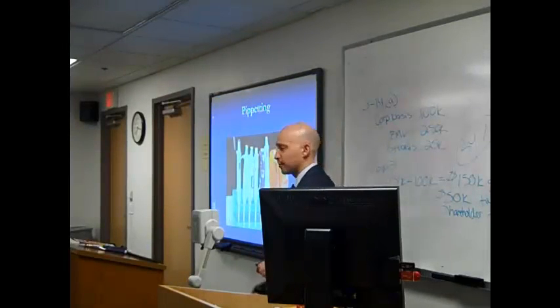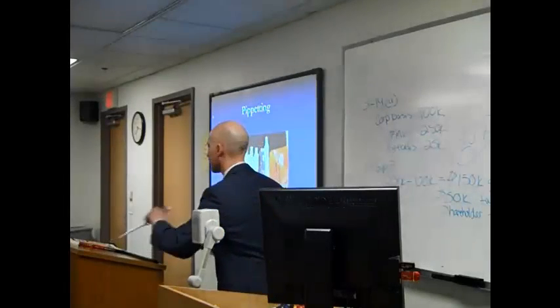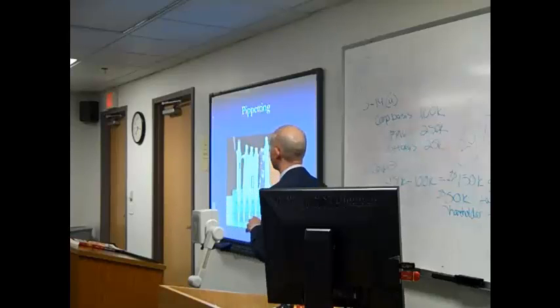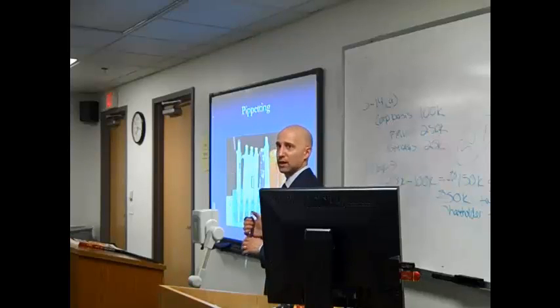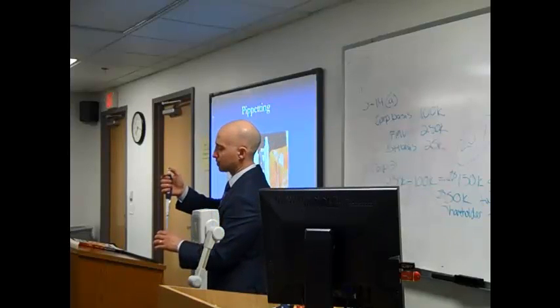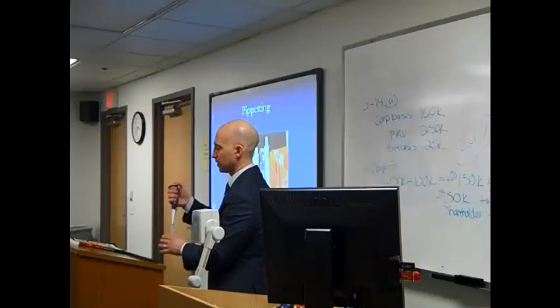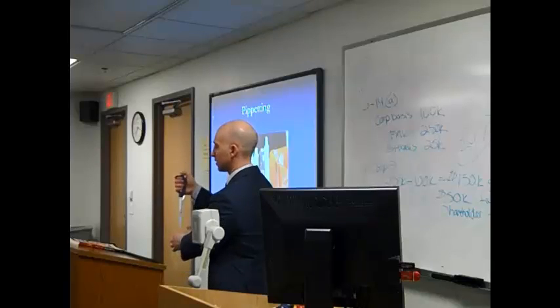All right, so there's the sampling, and I'm going to pass this around, but generally in these laboratories there's what's called auto pipetting, meaning they're not doing it by hand, but I have a hand pipette here. And essentially the lab chemist puts the pipette into the vial, takes out a certain amount, it's going to be 1 milliliter on here, takes it out, and then puts it into the vial.